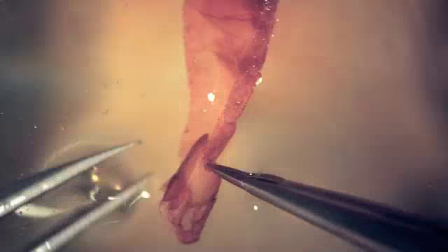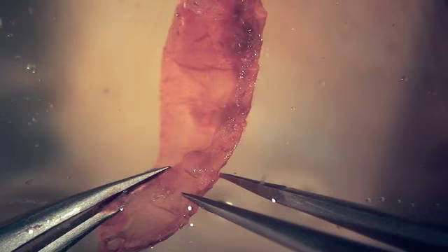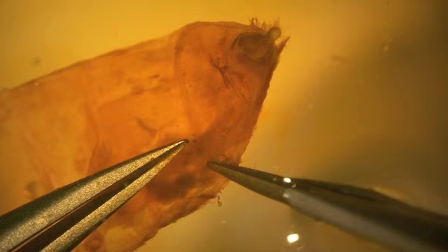Beginning at the open end of the abdomen, the ventral and dorsal sides are gently torn apart all the way to the last abdominal segment, just before the ovipositor.